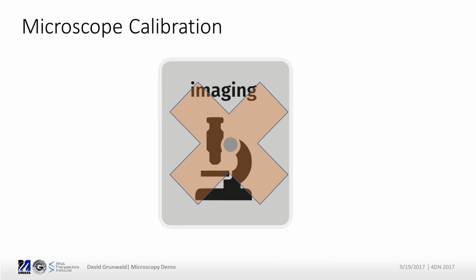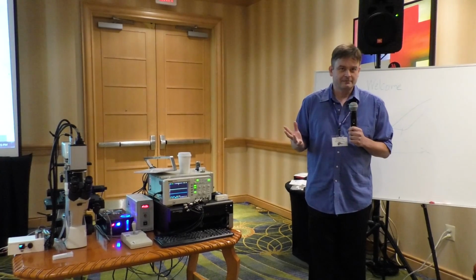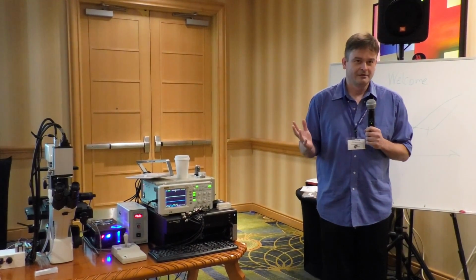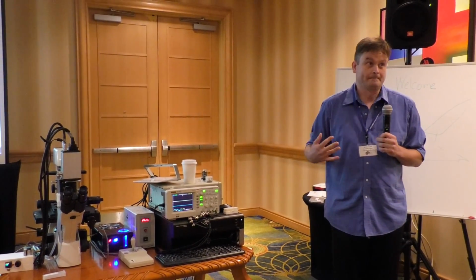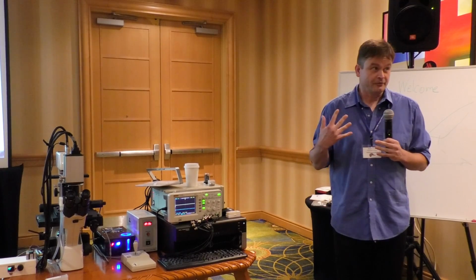Now, here's the only little problem. There's a good number of people in the field, and they have my respect. I don't really disagree, but they say this can't be done. There's no way. This has been tried before. You shouldn't. How do you do that? Because what you would need is to put a power meter somewhere. You need to take some measurements, and that's going to go wrong. Like in an applied physics class, most likely 90% of the students won't put a power meter the right way into a microscope. So there's that sort of concern.